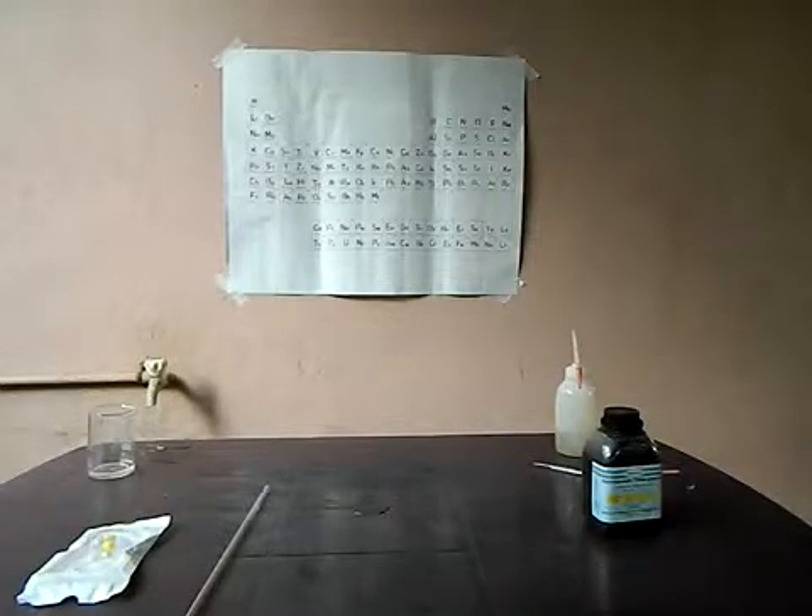Hi YouTube. Welcome to another video from LabFund. In this video I thought to show you how to be more economical in buying and making some of my equipment. I'll show you just how to make a burette in a very easy way.